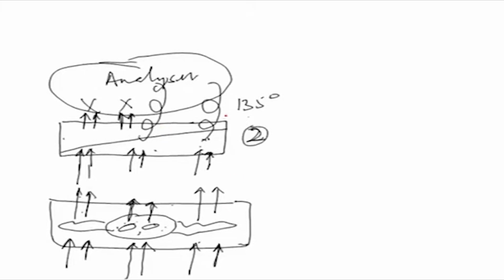The light which is polarized after combination, whose plane of polarization matches the axis of the analyzer, is parallel to the axis of the analyzer, and it will be passed and form the image on the image plane. So, this plane polarized light, the combined light only, passes and gives various interference patterns to give an image which could be dark or bright, as mostly it has a 3-dimensional quality because it gives shadows on one side.